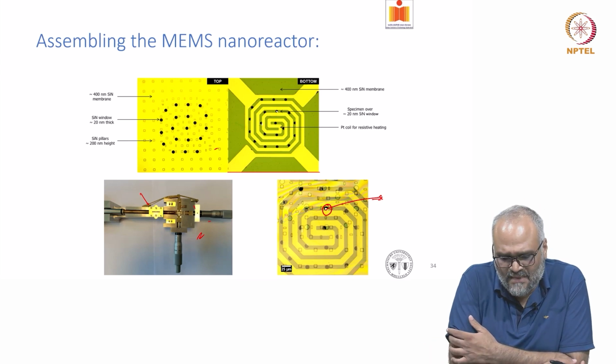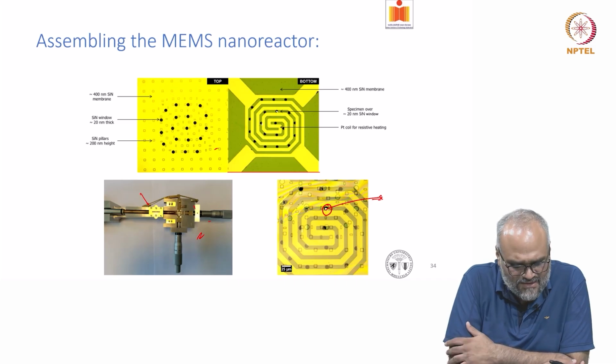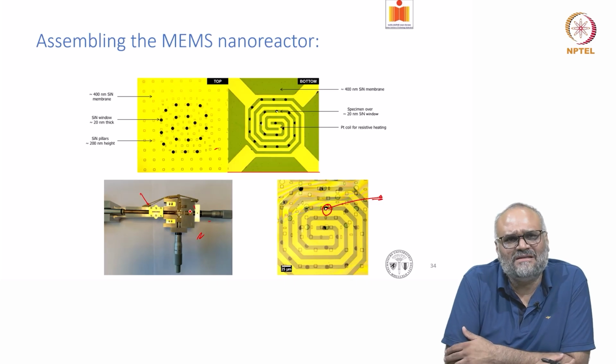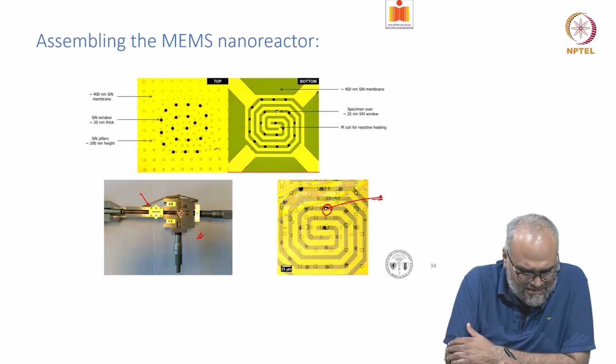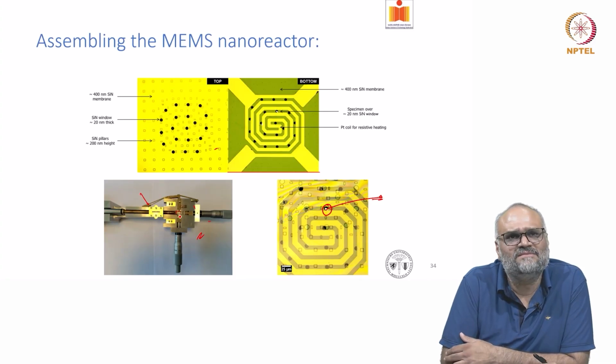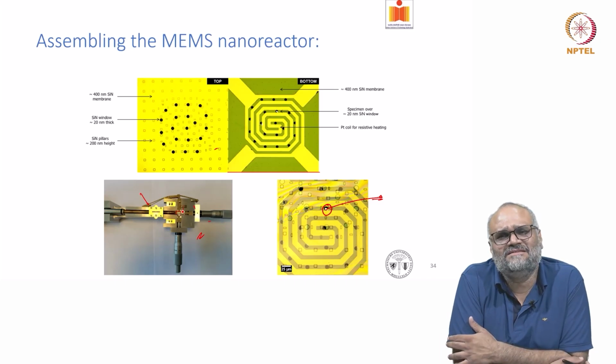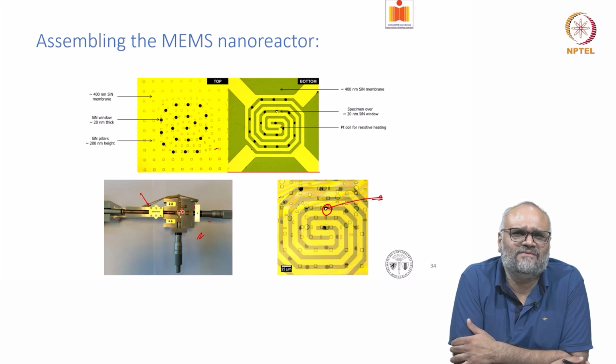And in the next versions of the holder that we developed, we got a holder into the alignment tool as well. And the idea is, you place the chips here and you seal on the top by just placing O-rings. You can actually get vacuum sealing in a reasonably good way. So in the beginning, we were actually gluing these chips together with water glass so that you could achieve pressures as high as 4.5 bar.